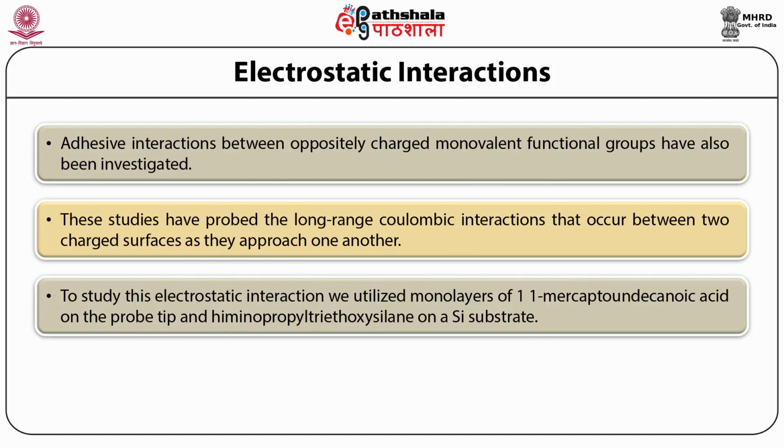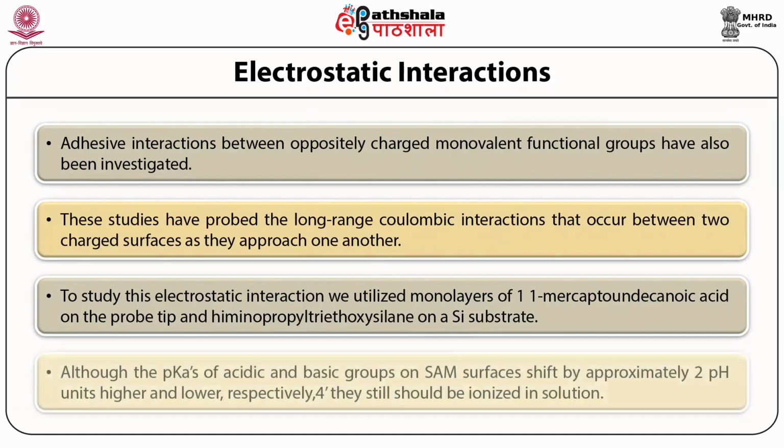Simple amines and carboxylic acids are well known to be ionized in aqueous solutions under neutral conditions. Although the pKa of the acidic and basic groups on SAM surfaces shift by approximately 2 pH units higher and lower respectively, they still should be ionized in solution.